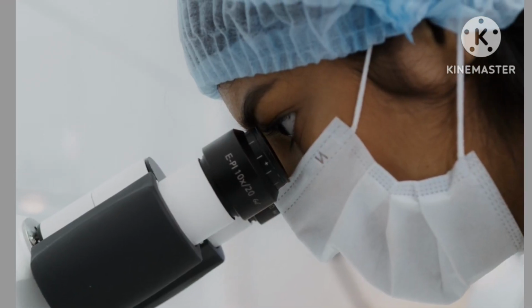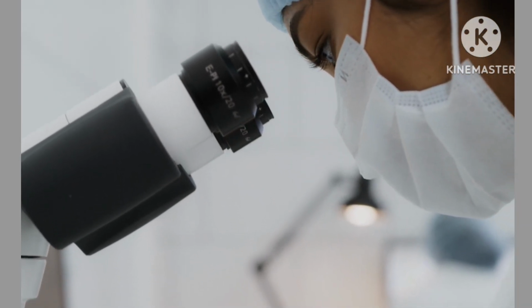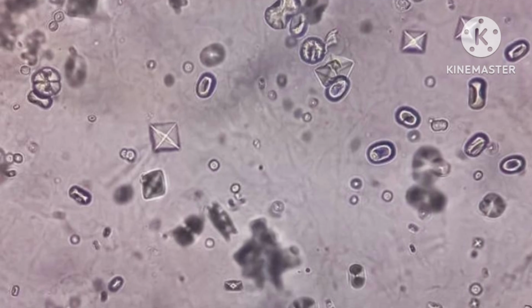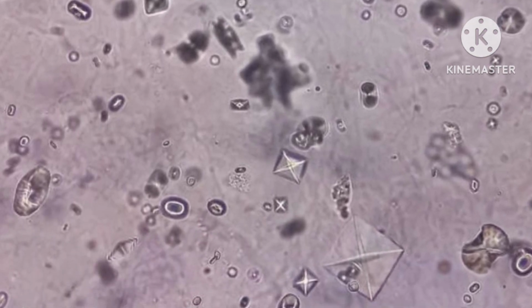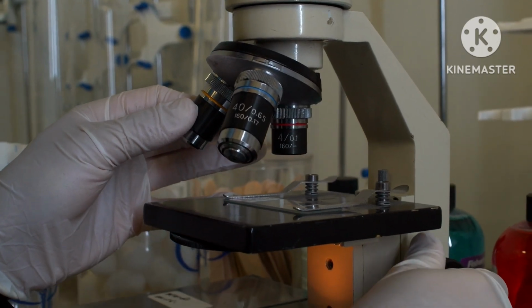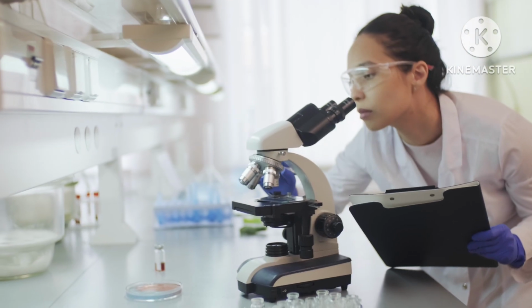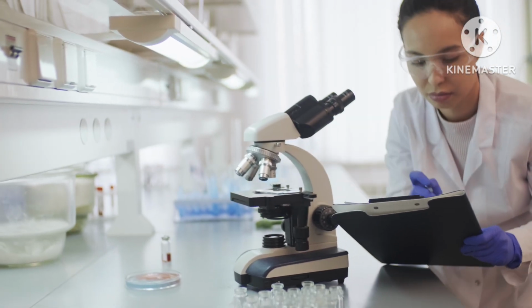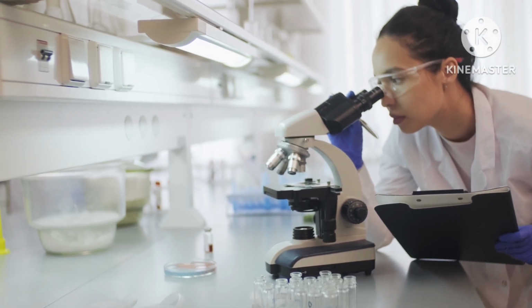For example, if a patient has fever and the doctor suspects malaria, the lab may examine a blood smear under the microscope to look for the parasite. If a patient has burning urination, the lab may examine urine under the microscope to look for pus cells, RBCs, or crystals. So, the microscope is not just for seeing something small, it helps us detect disease, study samples, and support diagnosis. So, basically, whenever the sample contains tiny structures that matter for diagnosis, the microscope becomes useful.